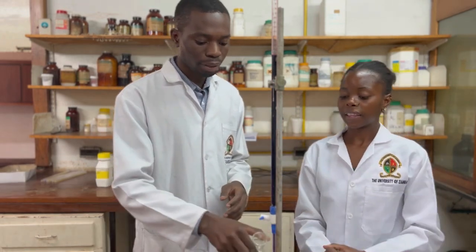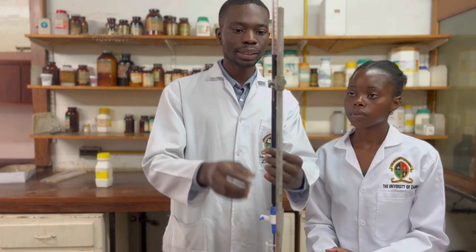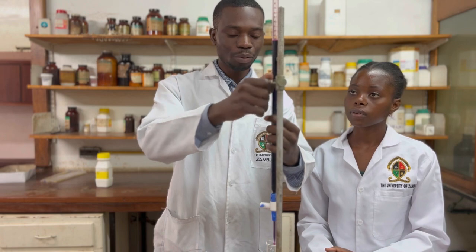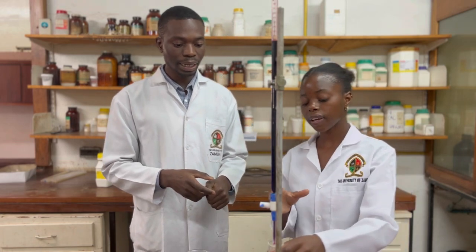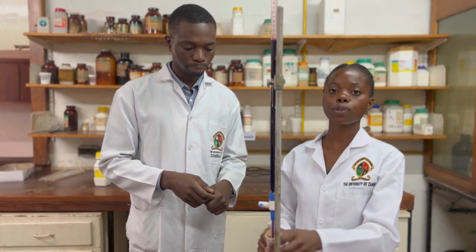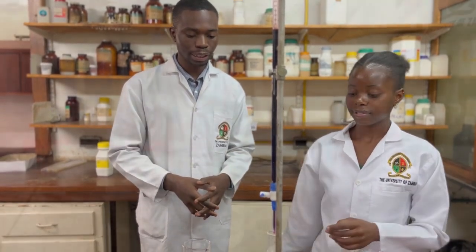Alright, so Ms. Wale here is going to give us a clear demonstration of how the lab is done. Like you emphasized, we have made sure that what is in the conical flask is the iron(II) sulfate mixed with the sulfuric acid. At the end point, what do we expect? We expect a faint pink color, because the potassium permanganate is self-indicating. There is no need for an indicator. Alright, we can go on with the titration.